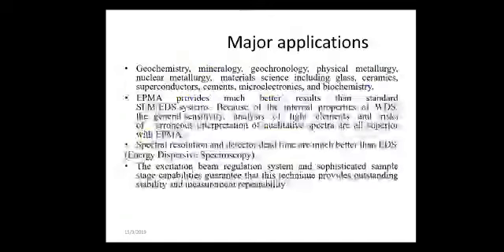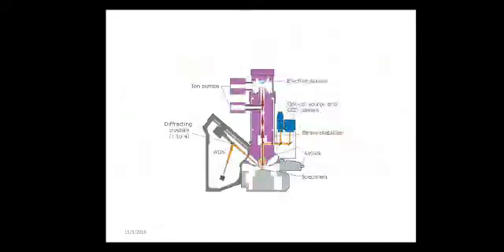So what are the advantages and disadvantages of this electron probe micro analyzer? The electron probe micro analyzer is the primary tool for chemical analysis of solid material at small spatial scales, and the chemical analysis can be obtained in situ, which allows users to detect even small compositional variations within textural context or in chemically zoned materials.